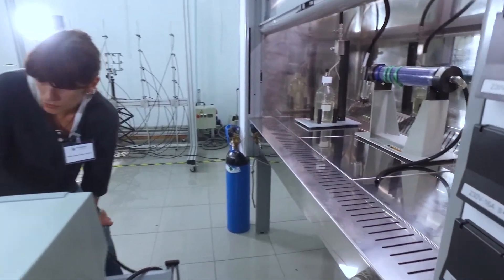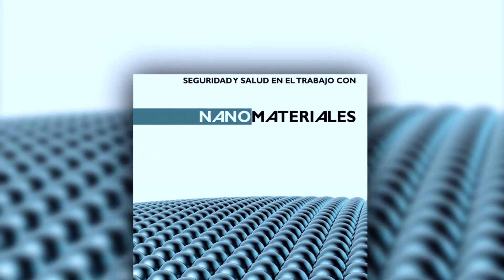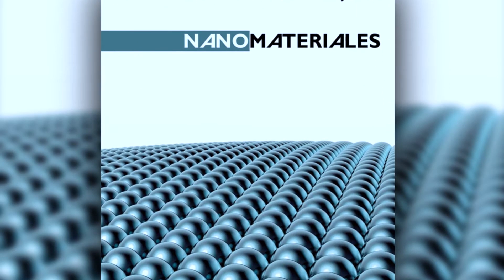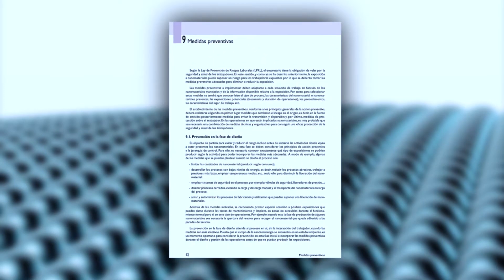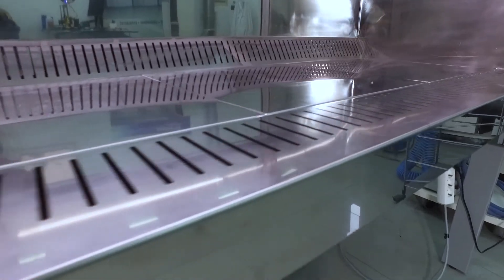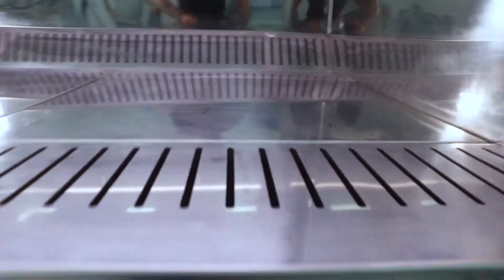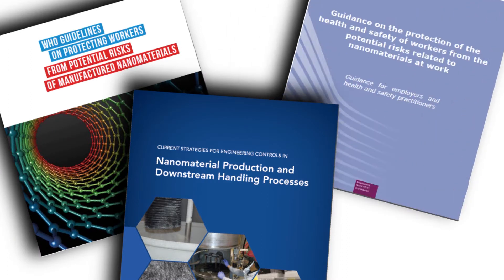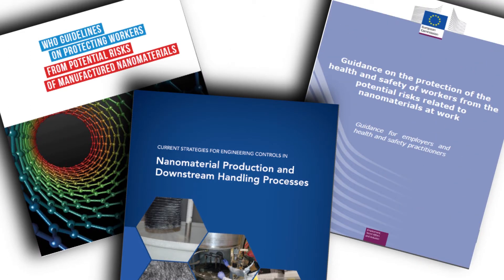The state of the art of collective protective equipment is given by the Health and Safety at Work with Nanomaterials Guide, published by the National Institute of Health and Safety at Work. Additionally, the recommended preventative measures are defined by the European Commission, NIOSH, the National Institute of Occupational Safety and Health, and the WHO, the World Health Organization.